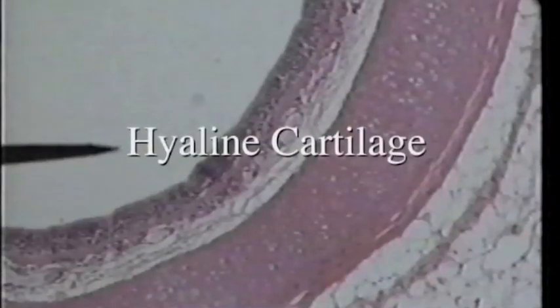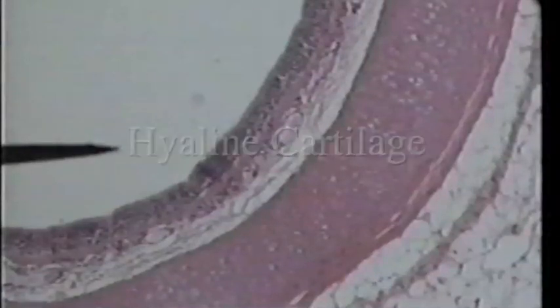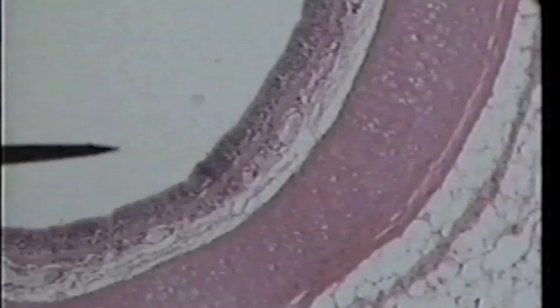The pointer is found in the lumen of the trachea. The first layer of tissue lining the lumen is pseudo-stratified epithelium, or it could actually be stratified columnar epithelium. We're now interested in that thick pink layer deep to that epithelial layer.